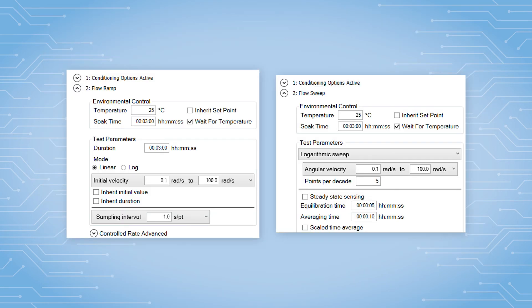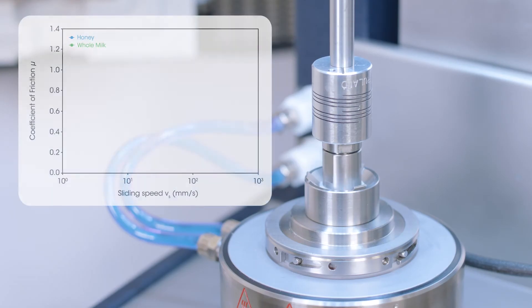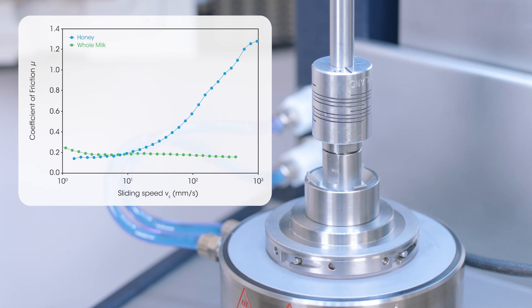The test procedure of measuring the coefficient of friction as a function of sliding speed can be either a flow ramp or a flow sweep. Here is one example of testing the coefficient of friction between a steel ball and three steel plates using milk and honey as a media.